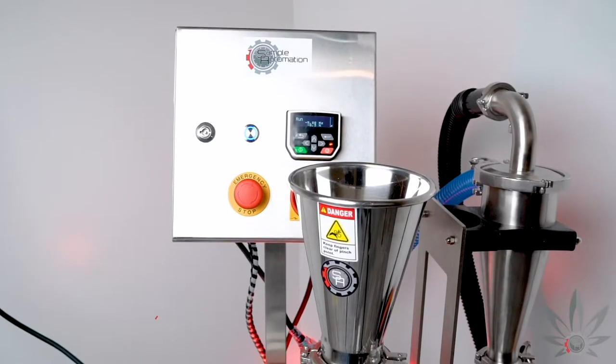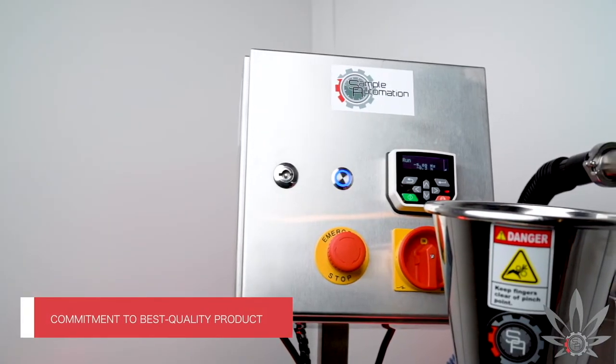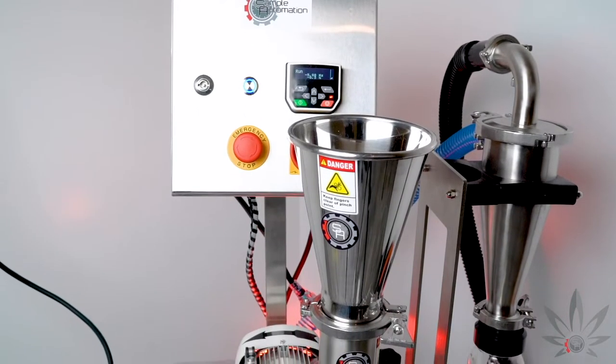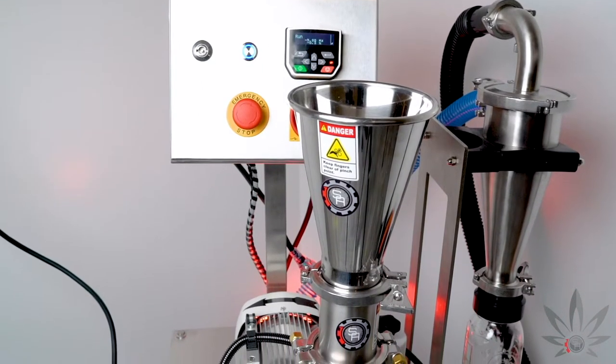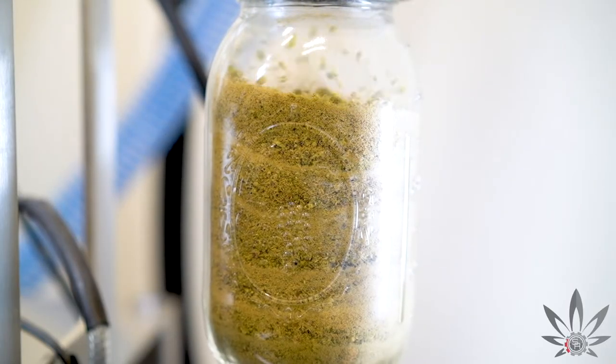Sample automation is committed and constantly striving to put out the best quality possible. Nevertheless, depending on your selected parameters and given the varieties that often exist in processing materials, we would still suggest using a sifter to remove any large flower or stems that may have found their way through.